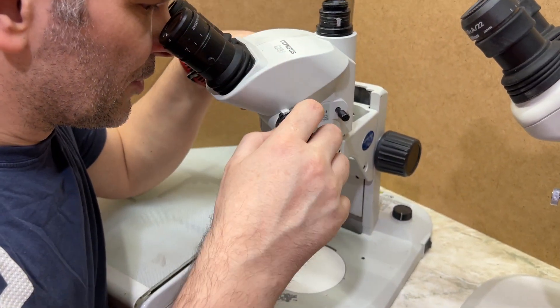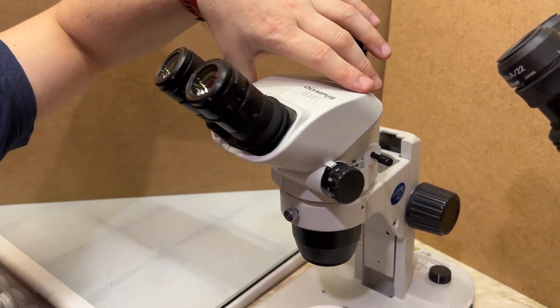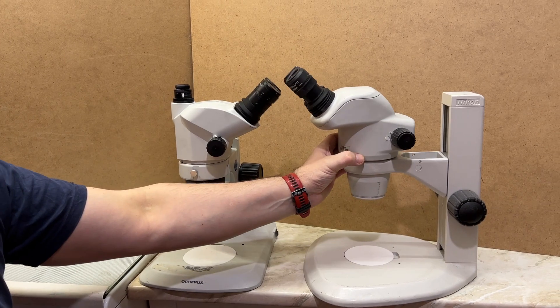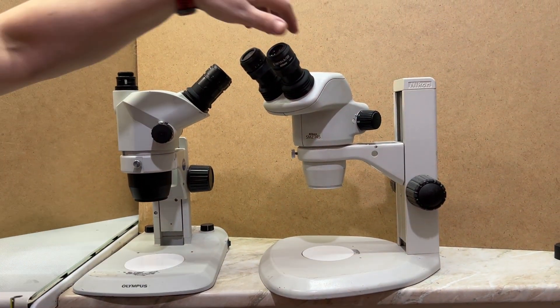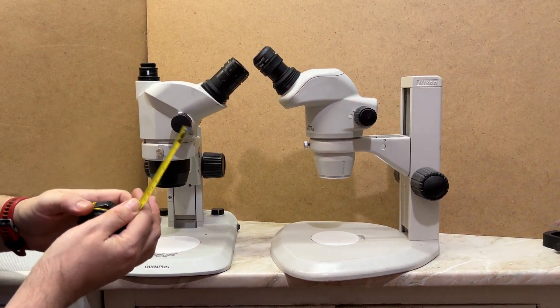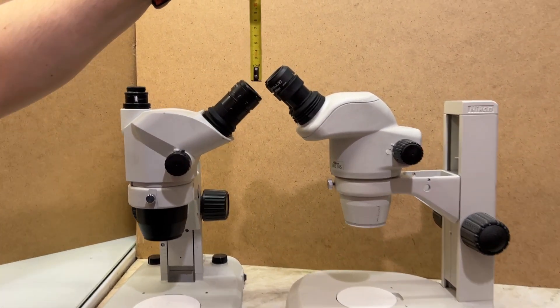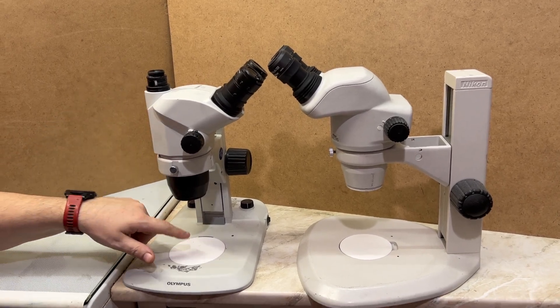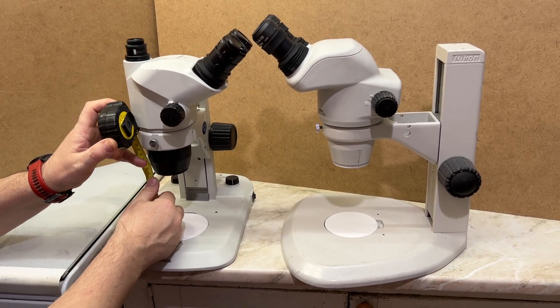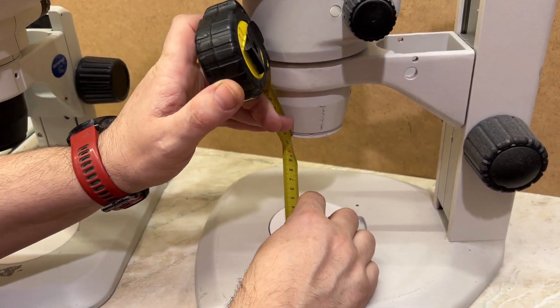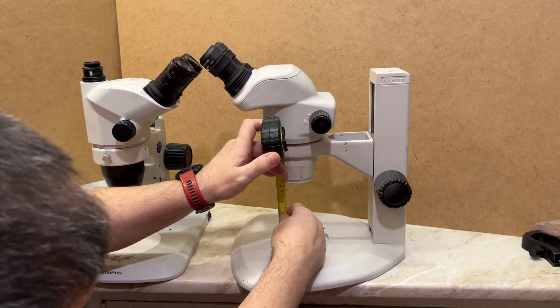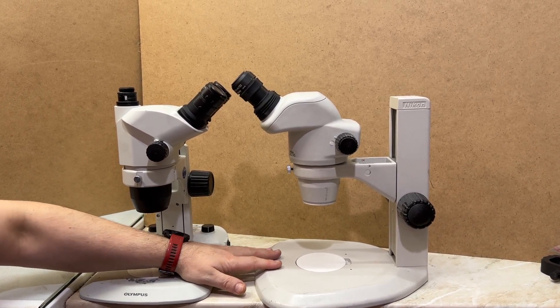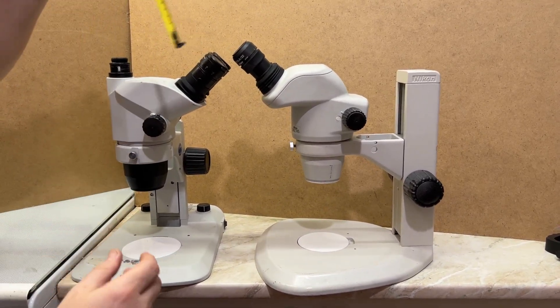Let's see the working distances of the Olympus CZ61 compared to the Nikon SMZ745. If we look from the side we can see about two or even three centimeters difference. This means that Olympus is sitting much lower. We have both microscopes set at their working distances: 11 centimeters and 11 and a half. Both microscopes have their working distances, but the Olympus stand is a bit thicker, about three or four millimeters. The Olympus is two and a half centimeters lower overall.